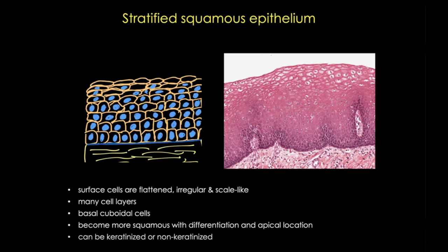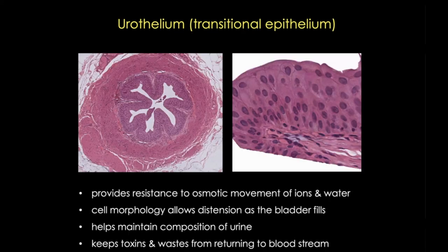Now let's take a look at urothelium. Recall that urothelium, as shown here in the ureter, is important for helping to keep the hypertonic urine from returning to the blood or from leaking out and damaging our tissues. It also needs to be able to distend as the bladder fills without rupturing or leaking. Therefore, the morphology of this tissue reflects these different needs.